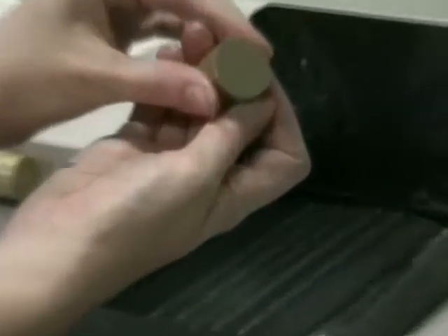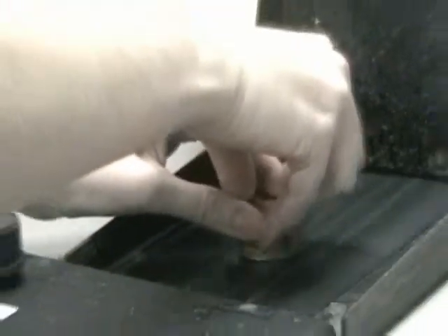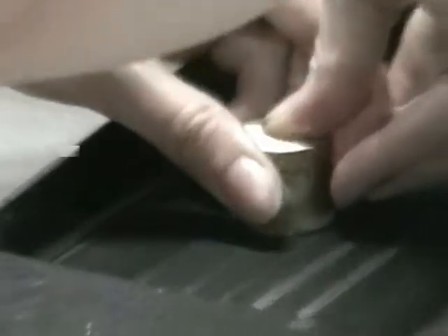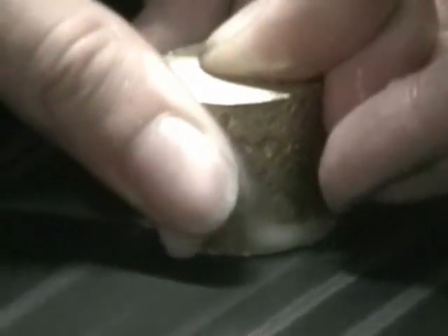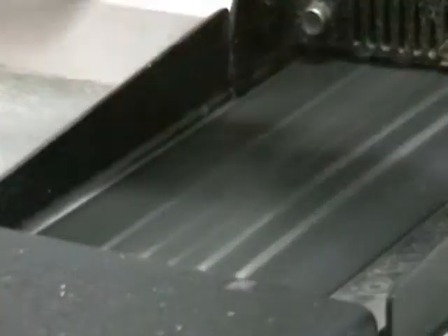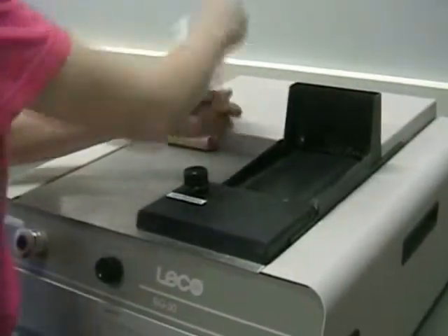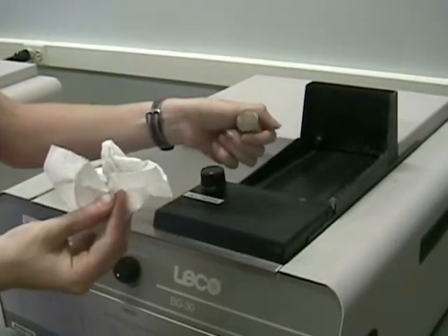Here we have a sample that has a bevel. That's not good because it will obscure the micrographs that you would like to take in the end. So you just hold the sample on the belt sander, keeping it as level as possible. It can take a while, but you'll end up with a nice smooth finish and will be able to polish the sample.